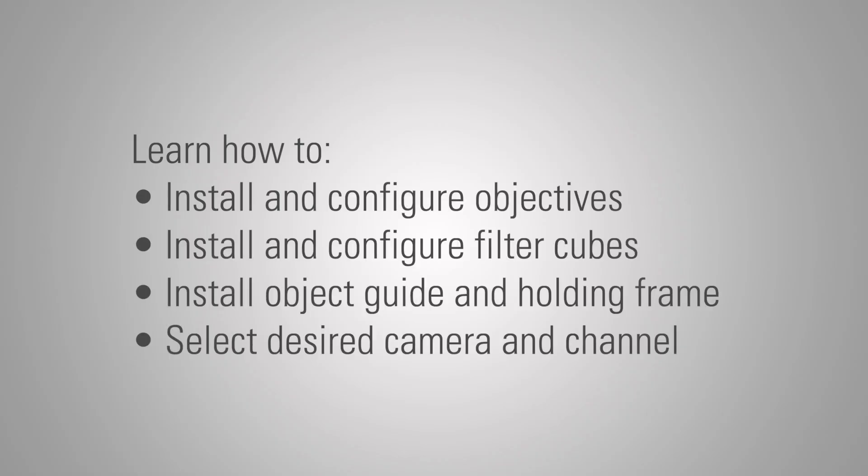In the next few steps, we will show you how to install and configure the objectives and the filter cubes, how to install the object guide and holding frame, and finally, how to select the desired camera or channel.